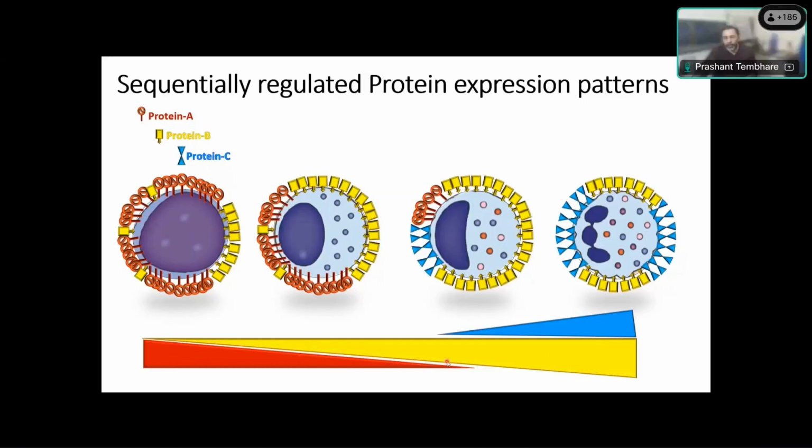And when the cell terminal becomes bigger, based on this we can establish a relationship between the protein expression level at different stages, and we call it a pattern. Because there is a regulated expression level, and there is a relation between two or three proteins. Combining this relation of expression levels, because these are highly reproducible, we call them patterns, and based on these patterns we can identify different stages of the cell's maturation. That's why we call it a maturation pattern based on the antigen expression or the protein expression.